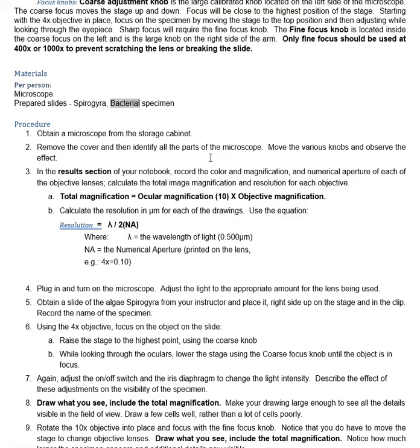But this time we know that we don't use our coarse adjustment knob, only the fine focus. We use that fine focus, get the sharpest picture, and we're also going to have to use that light dimmer wheel. We're going to have to try moving it back and forth until we get the right amount. And at this point, you probably are going to have to reach around. That iris diaphragm depends. There's a way of adjusting it, depending on the microscope. You want to try to move it and see what effect that has on your picture.